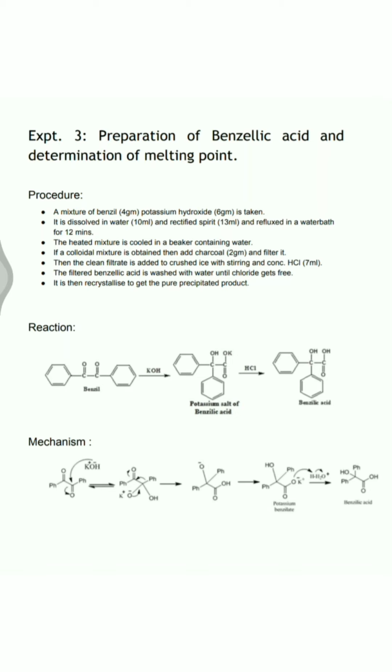Today in our virtual lab, our next experiment is the preparation of benzilic acid and the determination of its melting point. This is our general aim.